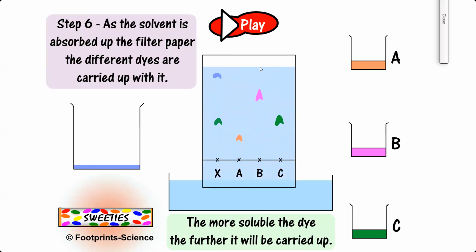So if it has stopped here, that would be the solvent front, and telling you that your X has 2 components, okay? In your X dye or your dye X, you have 2 components, and one of them coincides with C, telling you that X contains C, okay? And the other component is unknown, so we don't know this component here. So let's just run it all, and you can see.